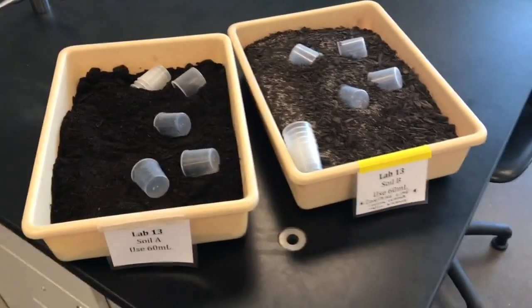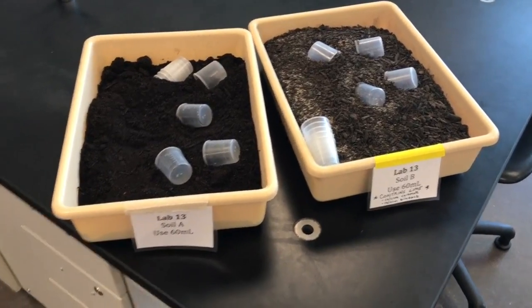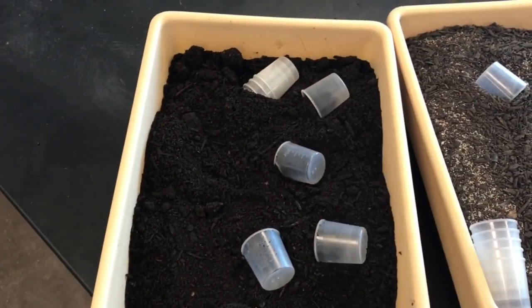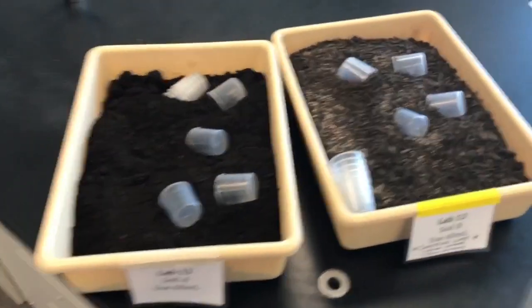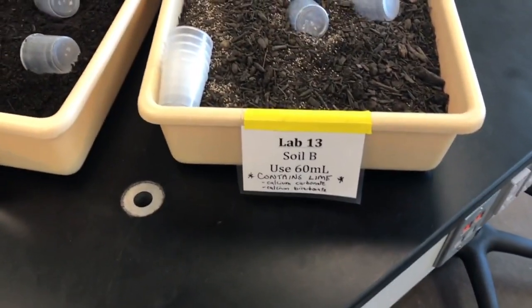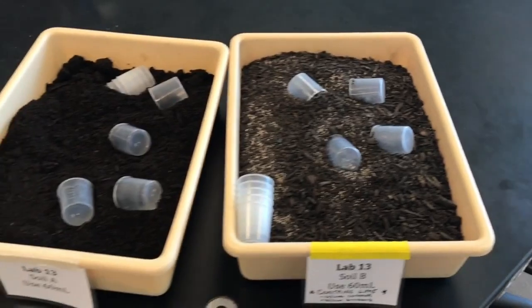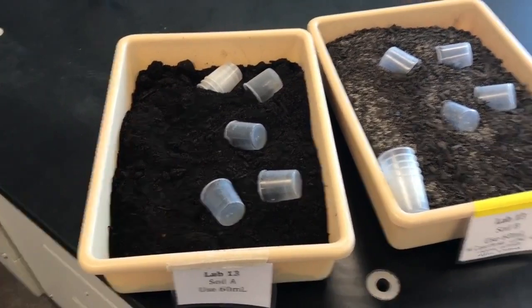So for this lab, we're going to use 2 different types of soils. We're going to run our sulfuric acid solution through both of these soils. So part 1 for this lab, we're going to be using soil A, which is just basically normal soil. The normal soil that you would find pretty much anywhere, just organic material. The second soil is actually the same soil, but mixed in, we have calcium carbonate. So we have some lime solution, calcium carbonate. So this is going to act as our buffer. And so this will be for part 2. You're going to use soil B for part 2. For part 1 right now, we're going to use soil A.